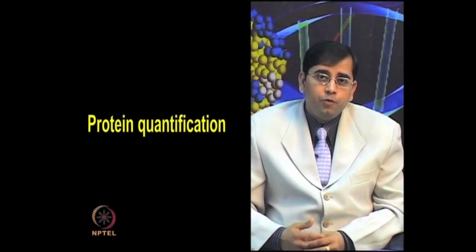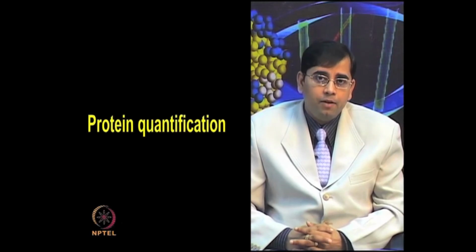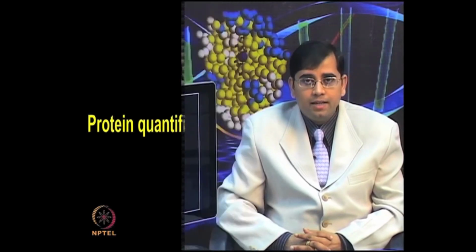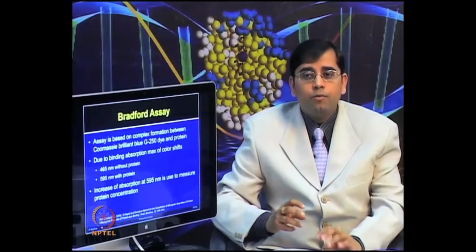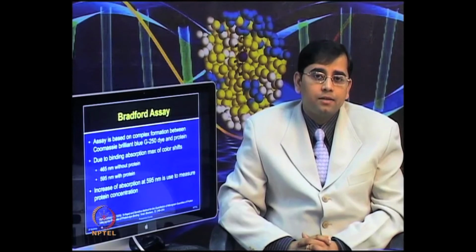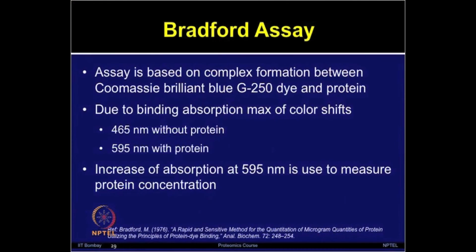So, there are different types of protein quantification methods available. We will talk about protein quantification in detail now. There is another popular method available, which is the Bradford assay. This assay is based on the complex formation between the Coomassie dye G250 and protein.